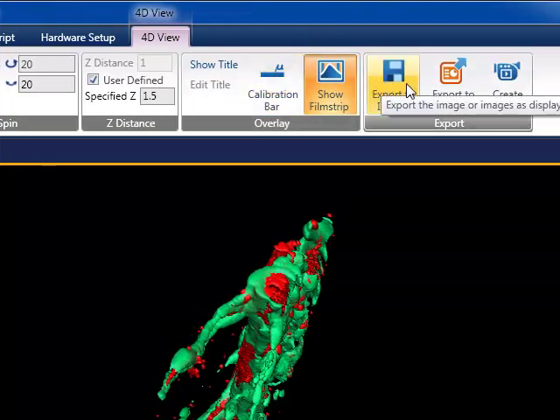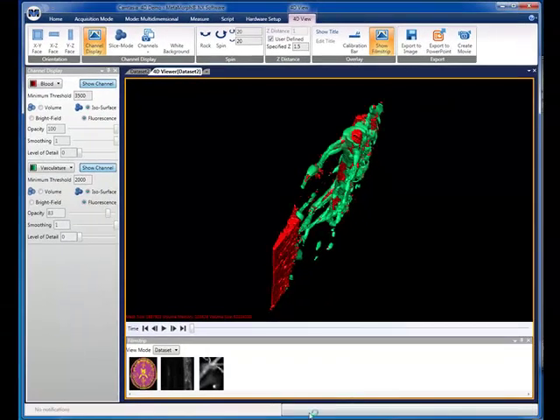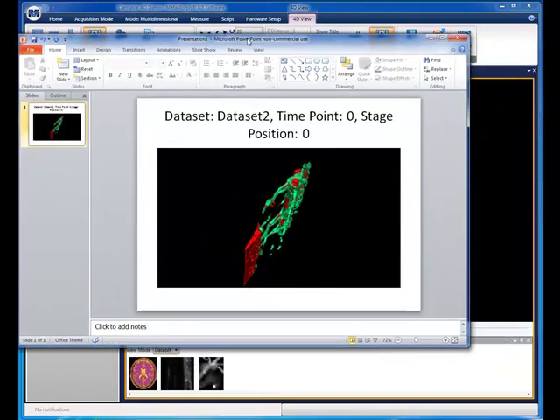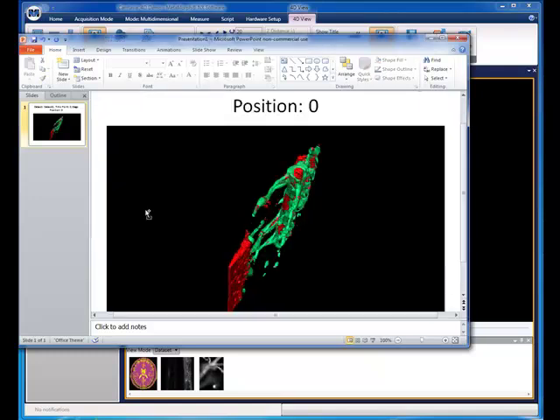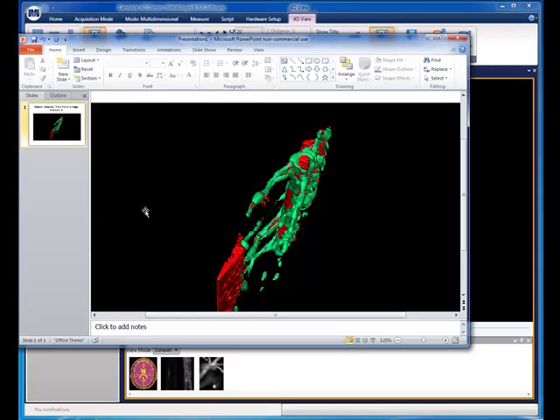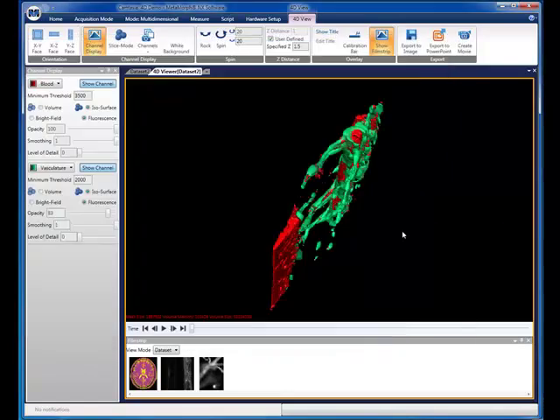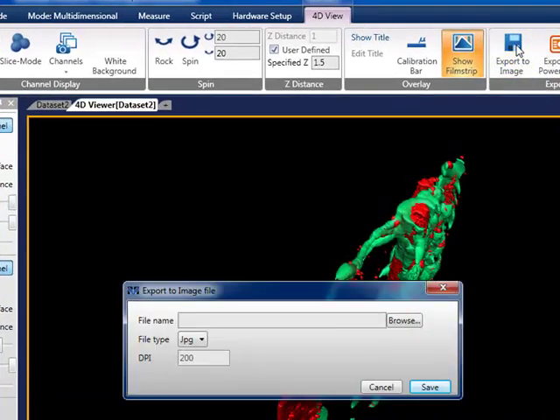First, let's export the data to PowerPoint for presentation. Now, let's export an image for publication.